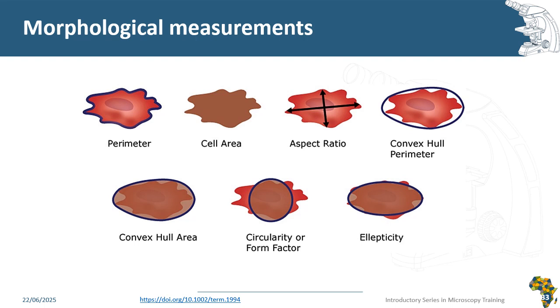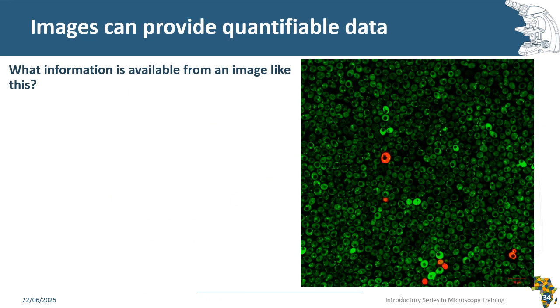I just want to cite one example. Tumoral cells usually have a higher aspect ratio, they are more elongated, and so on. Depending on your biological experiment, you can really have different conditions that bring different morphological measurements. And obviously, you can have intensity measurements.